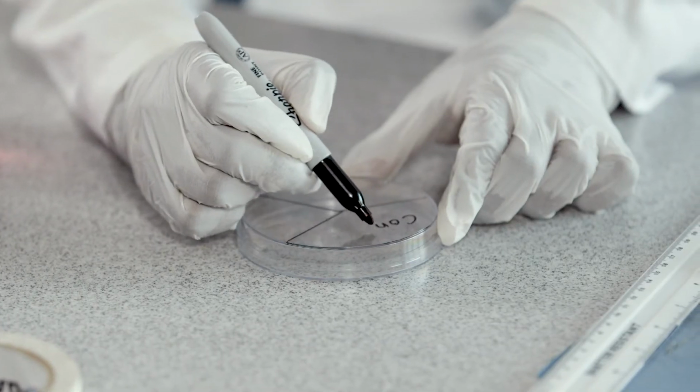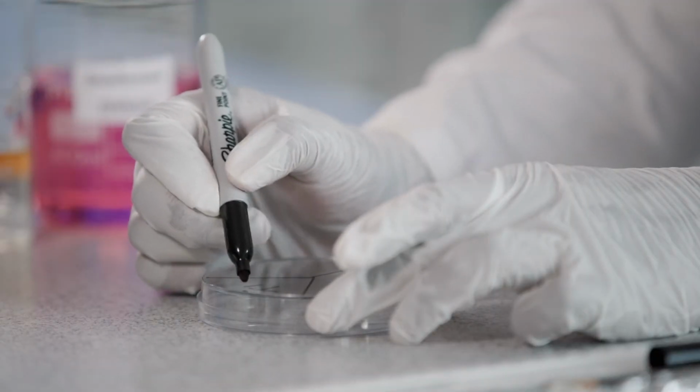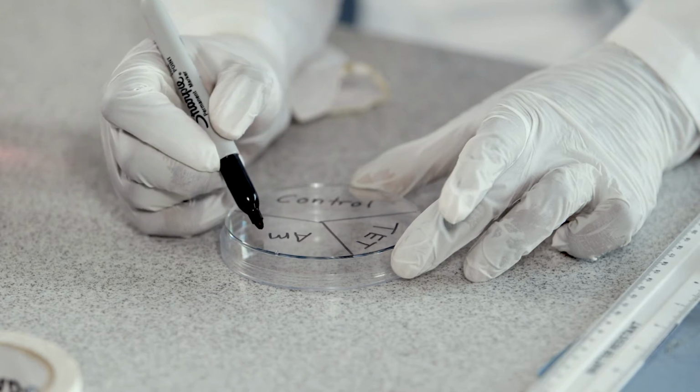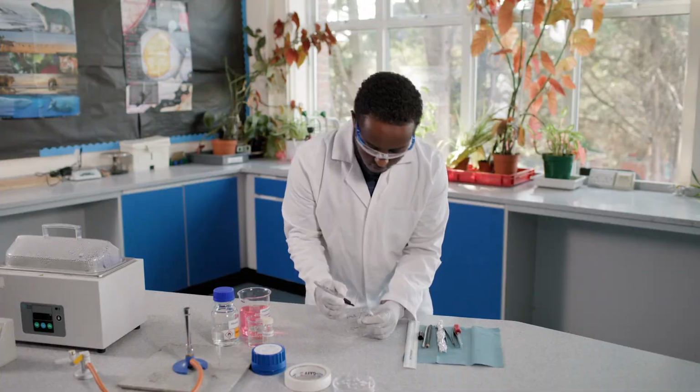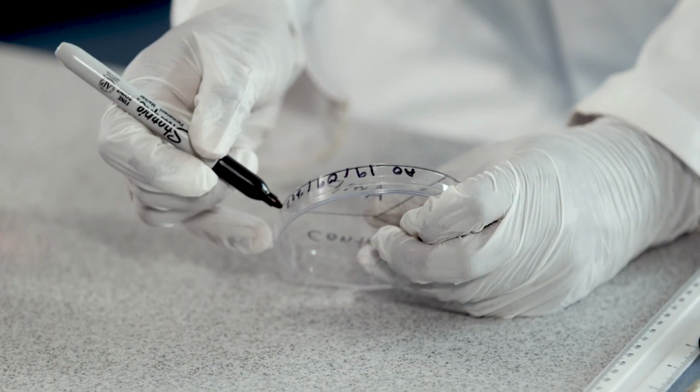Label one section control and the other 2 sections with the name or concentration of each antibiotic or antiseptic solution. Add your initials and the date near the edge of the dish. Turn the dish right way up.